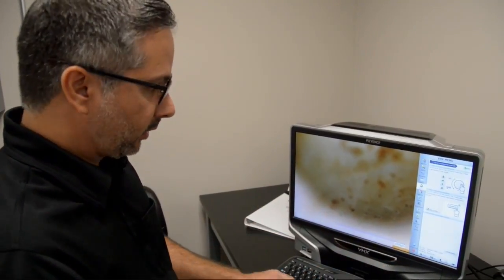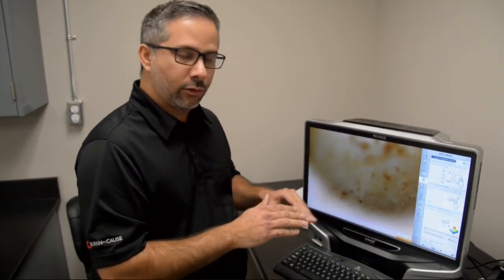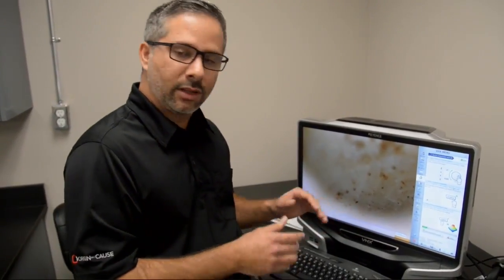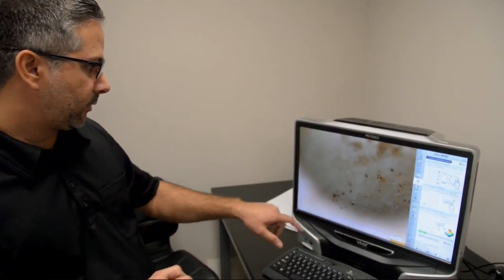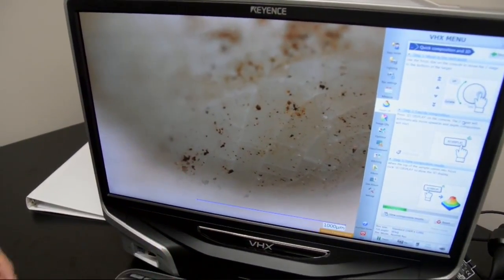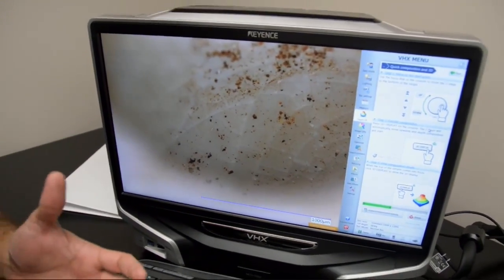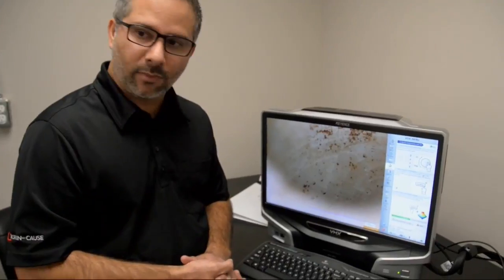The 3D microscope has the ability to let you run stacked images and get you a full frame in full focus. And that's very useful for our investigations. You can see here, it's going to take a couple more seconds. It's going to render that image, and you can pretty much see the cracking on the inside of that wall. Nick, if you can focus on this area here, all of those are cracks on the plastic component of the solenoid valve, and basically that's what caused that one to break apart. Sometimes they don't break, sometimes it just leaks, and it's just barely before they finally break. Hope that answers the question.